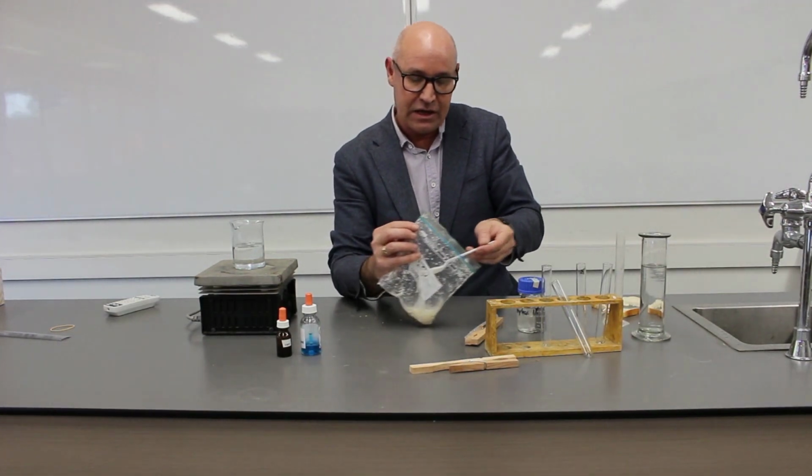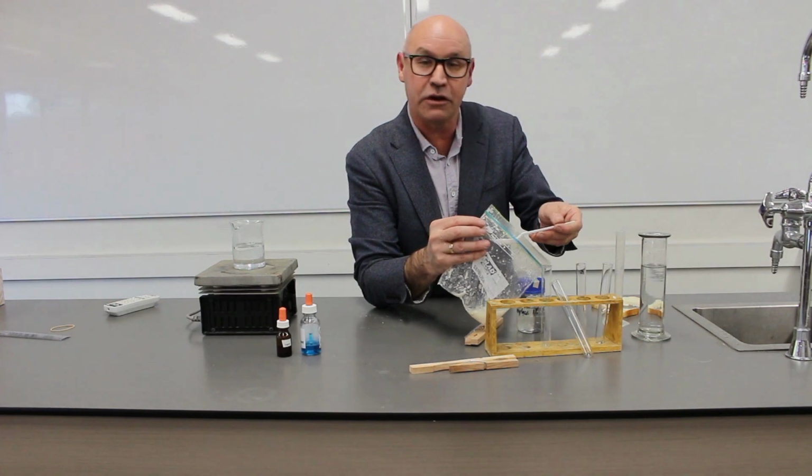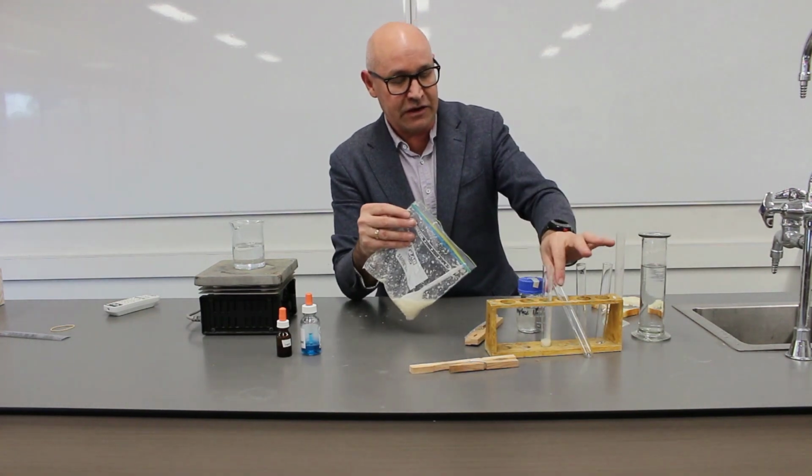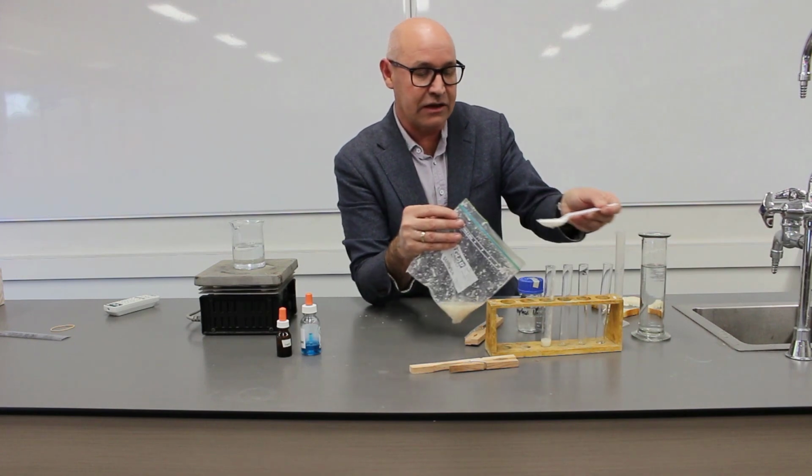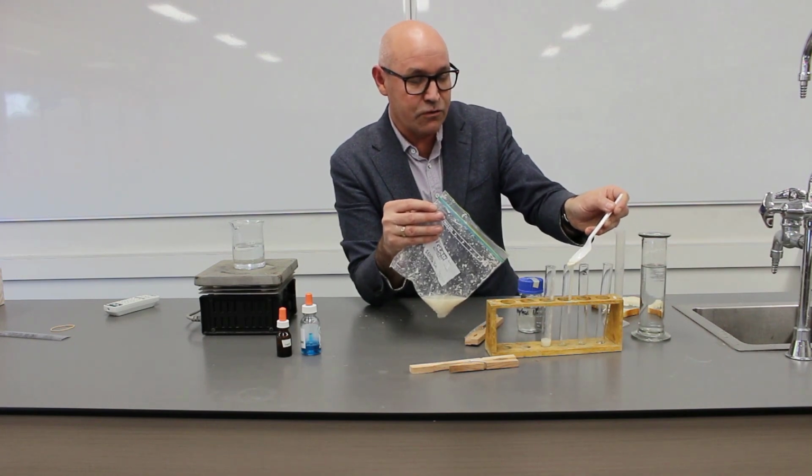So what we're going to do now is take a little bit of this out and put it into some test tubes, because we're going to do 2 tests. The first test we're going to do is testing for starch. The second test is testing for glucose.